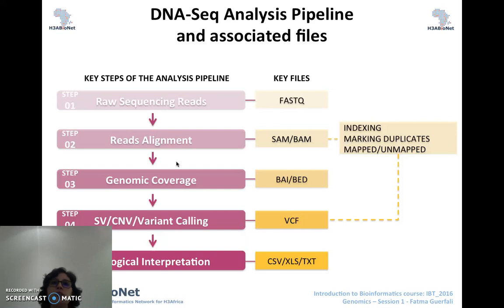So initially, the huge amount of data that is produced by the NGS instruments can be really scary. We are talking today about millions of reads sequenced, and these need to be carefully handled. So this is why there are a huge number of algorithms, software, tools and different methods that are constantly developed in order to ease that process. So you need to define first a streamlined pipeline in order to facilitate that data analysis, and also to be sure that you are interpreting correctly your biological question.